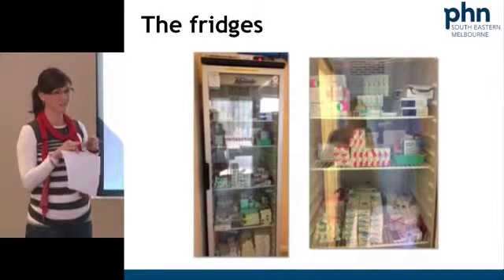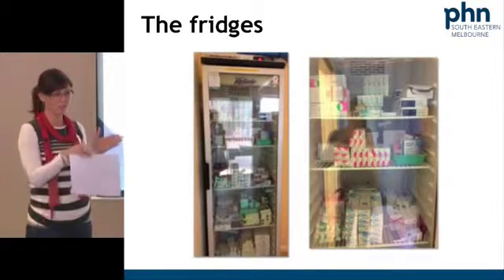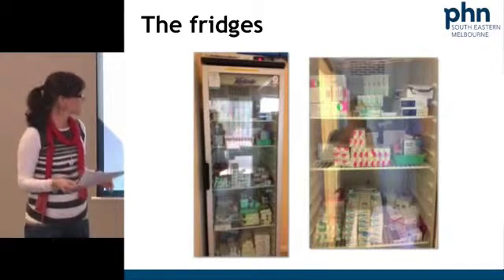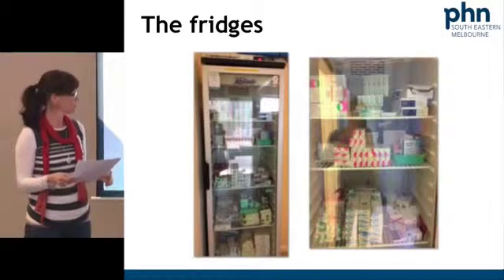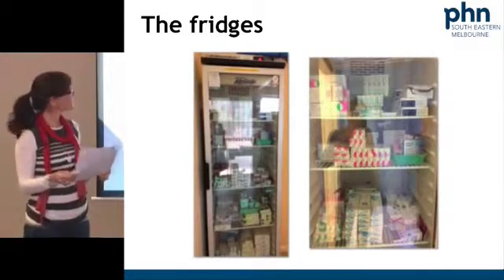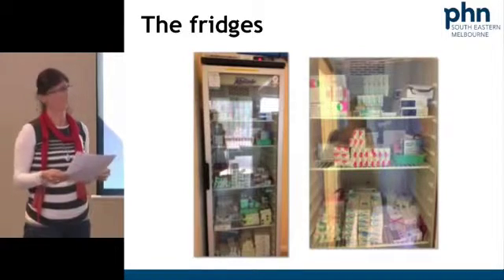We put the probe inside the vaccine box, so we're doing what the guidelines state. You can actually see it there. I think that's the probe inside that box, one of those boxes. That's just a hanging cord.